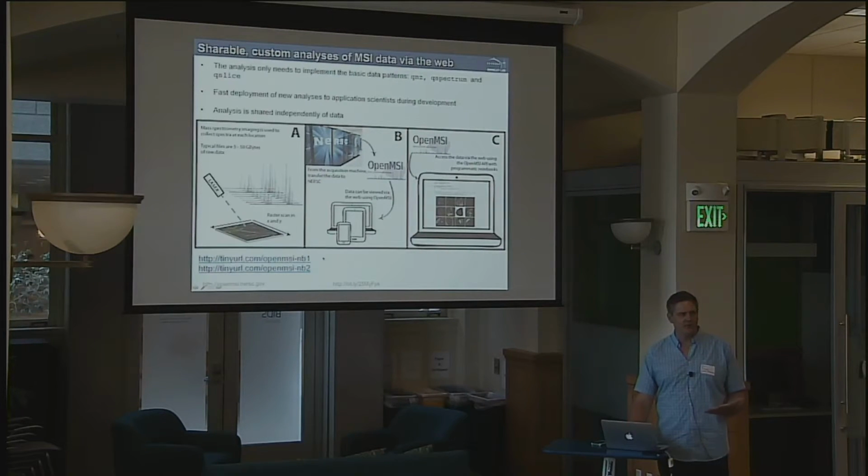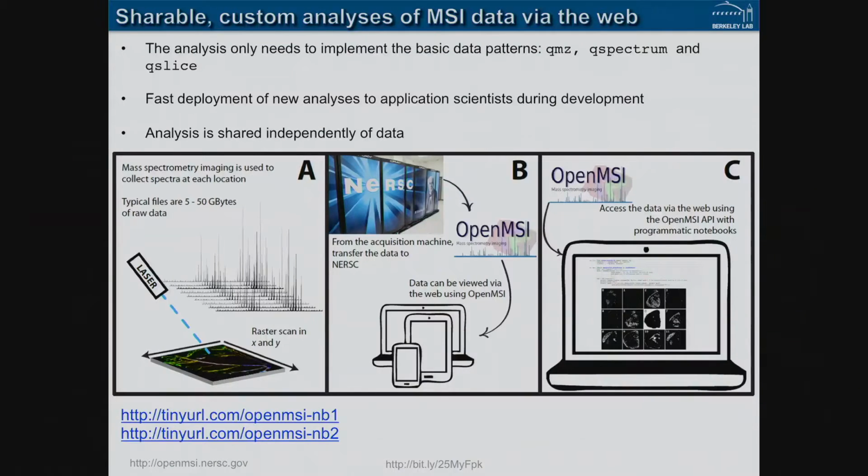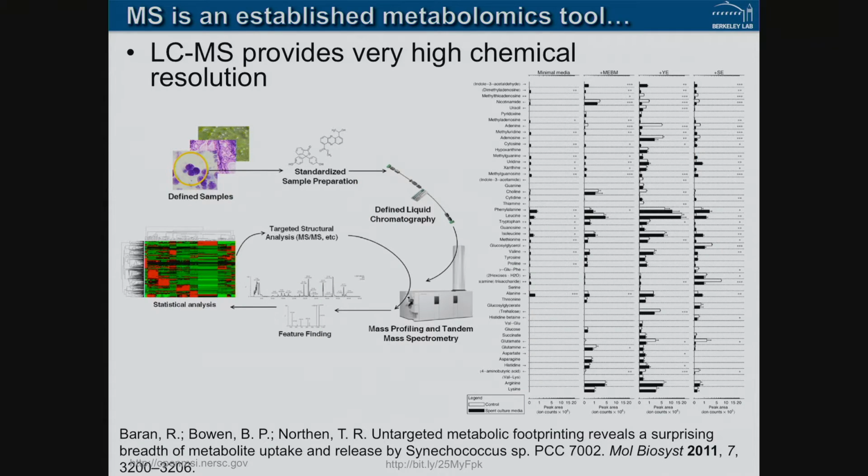You should be able to pull data from OpenMSI and do some image processing on them. I mean, simple stuff, like thresholding the image, changing the color scales on the images. But the point of the manuscript that these notebooks accompanied was to say, hey, we can use notebooks to share this with people, and you can reuse it. So that was really the point of the paper. It wasn't really how advanced the image processing was. It's pretty routine stuff, k-means, PCA, that kind of stuff.